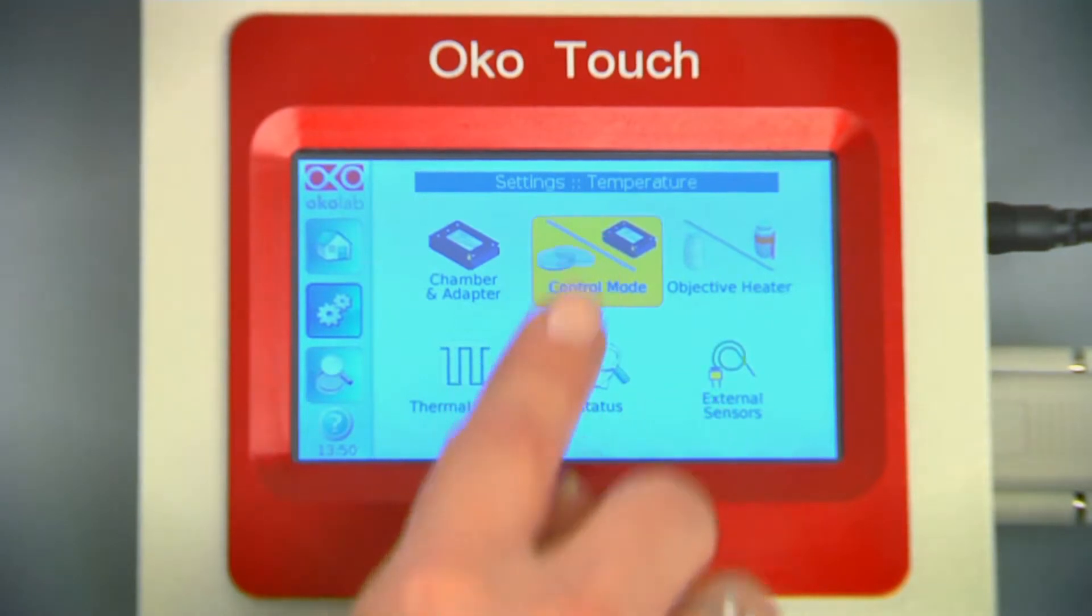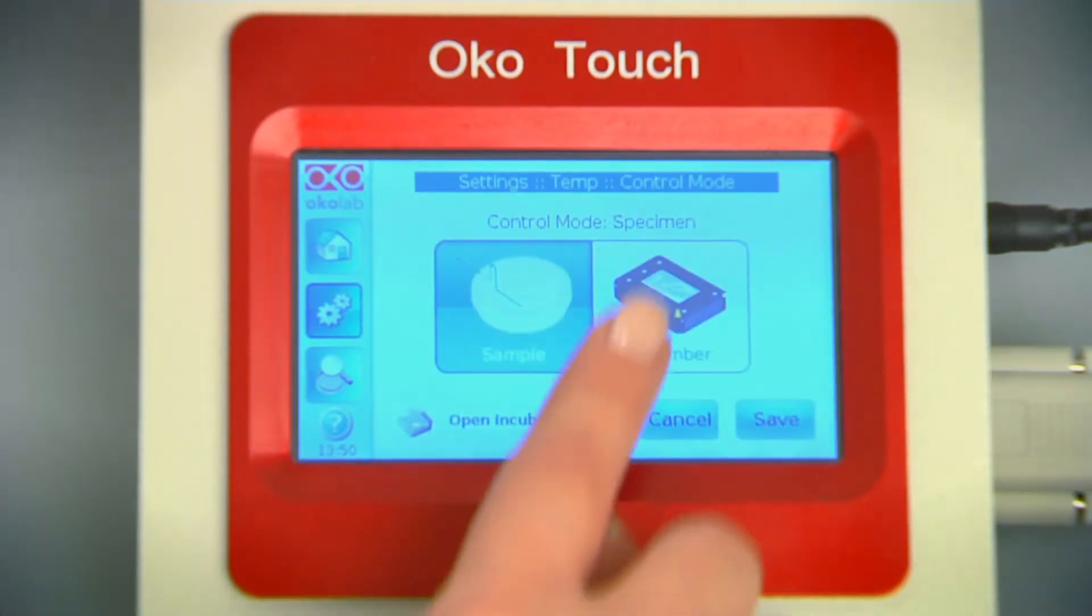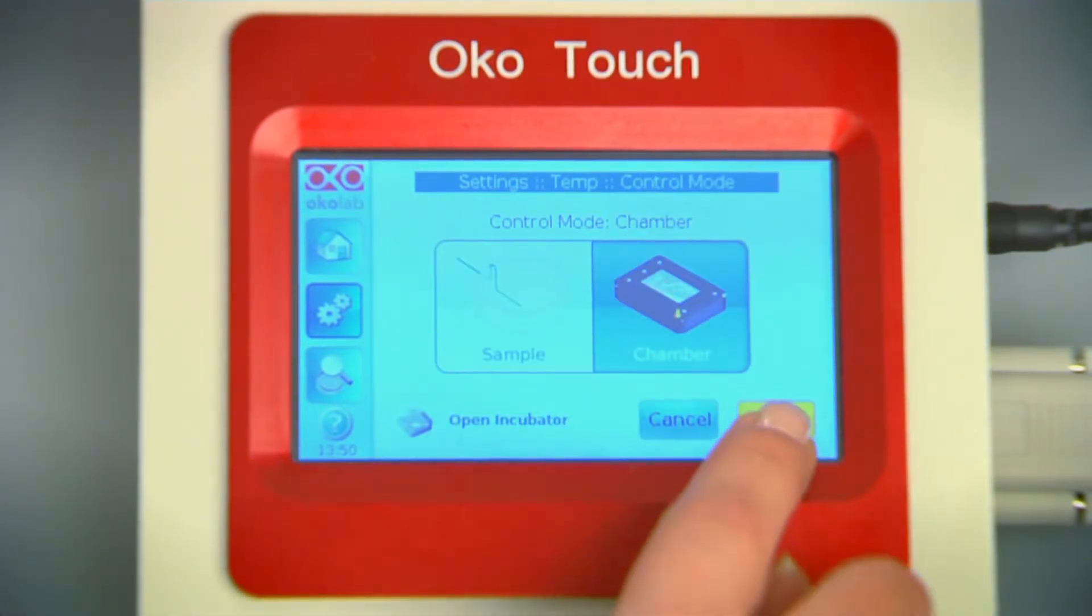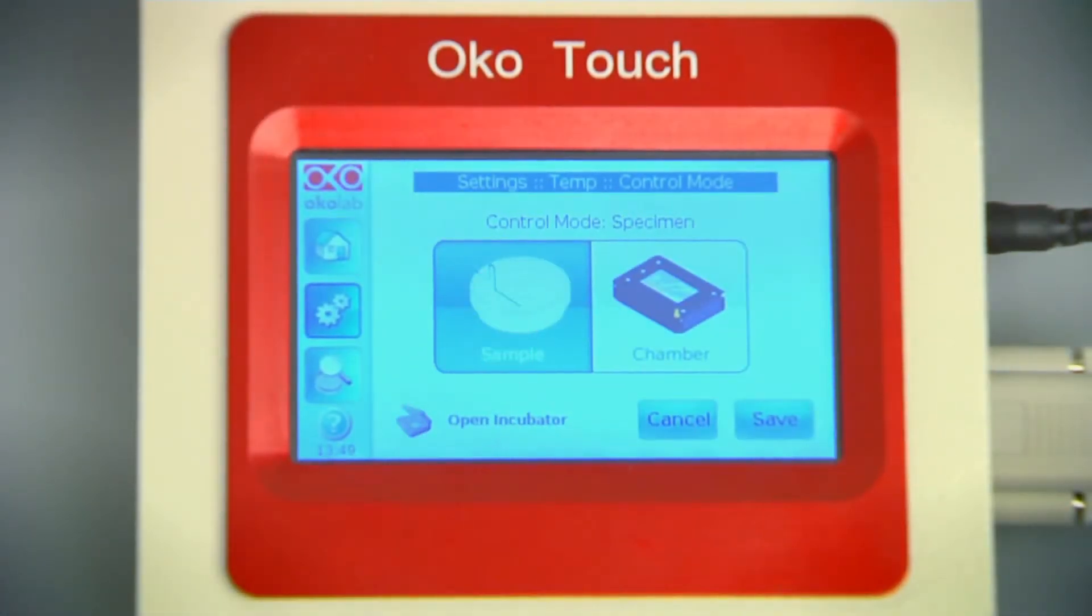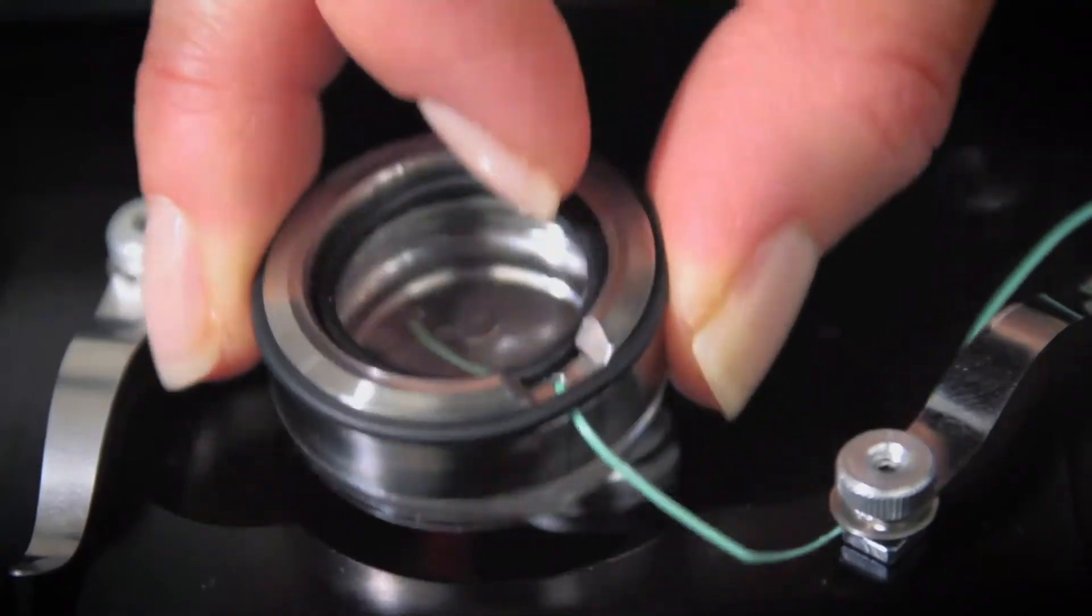Feedback to the controller can be provided either by the temperature sensor embedded into the chamber main body or by an external sensor conveniently placed in a reference well next to the sample.